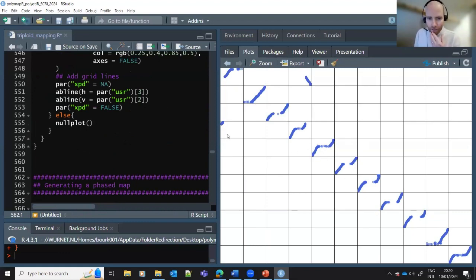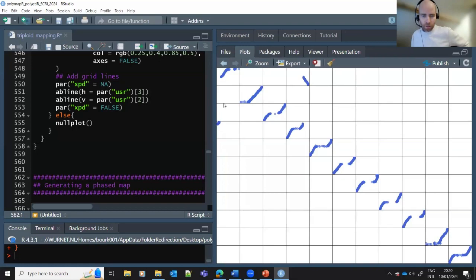So what we can see here very nicely is this translocation that we had previously found in a mapping study in banana. And again, this is the well-known translocation that occurs between chromosomes 1 and chromosomes 4. So on this axis here, on the y-axis, we've got our genetic position. So this is our genetic map position on the y-axis. And you can see here, there's no tension or break between these on the y-axis. It just continues along nicely.